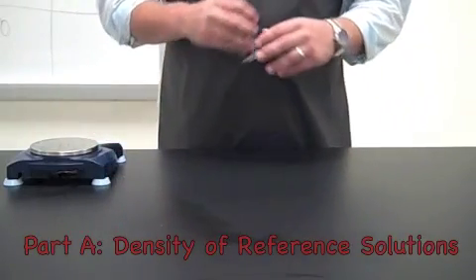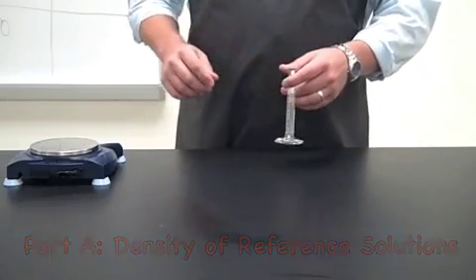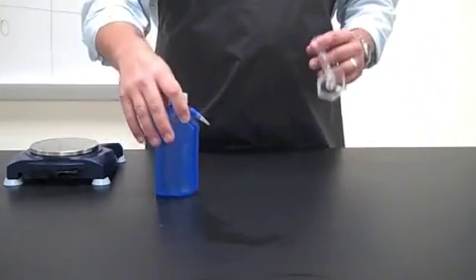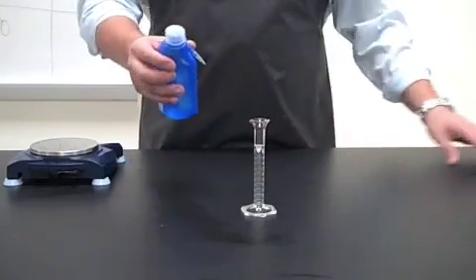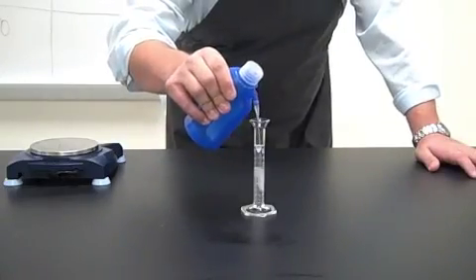To begin the lab, we are going to first start off by measuring the density of distilled water. You'll find the distilled water on your desk in the squirty bottle. We're going to take our graduated cylinder and measure exactly 10 milliliters.